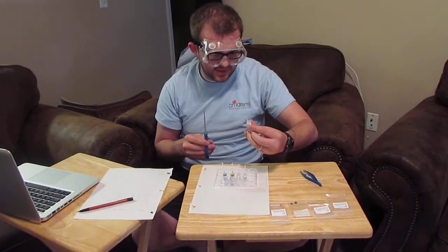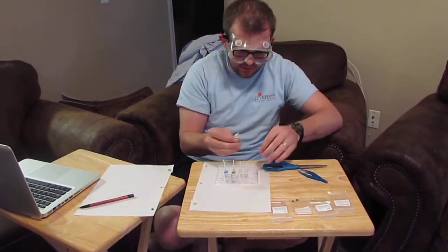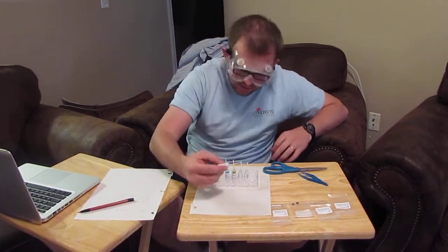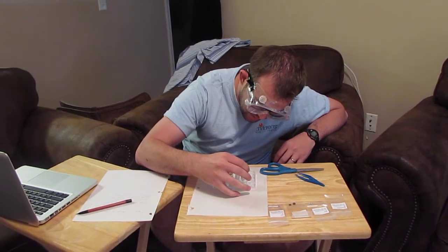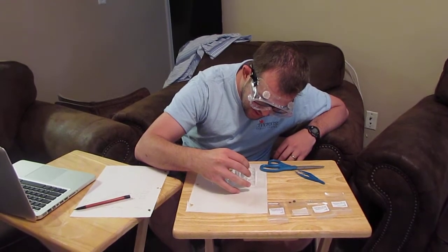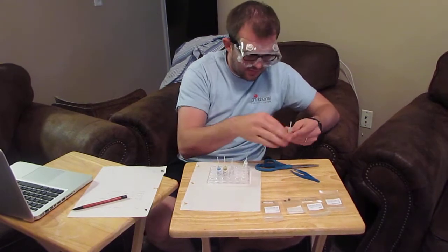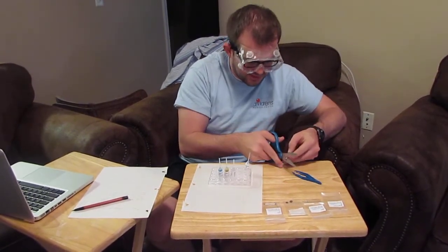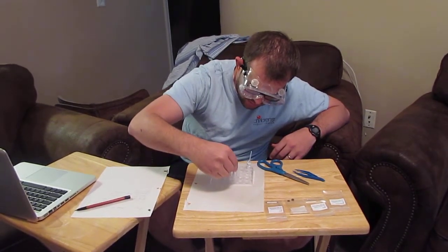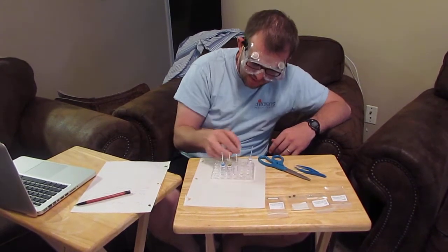First I have my sodium sulfate, and like I said, we're going to do 10 drops. I want to move these down just a little bit so I have a little bit of room. In A1, we got 1, 2, 3, 4, 5, 6, 7, 8, 9, and 10. I have magnesium sulfate. In A2, 1, 2, 3, 4, 5, 6, 7, 8, 9, and 10.